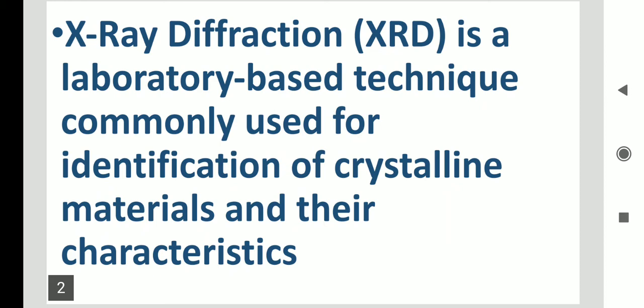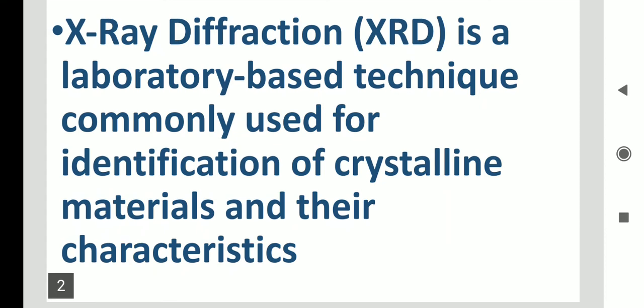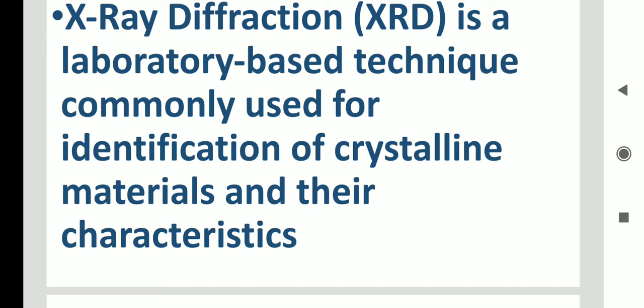It is a laboratory-based technique for the identification of crystalline materials and the study of other characteristics like unit cell, their parameters a, b, c, atomic packing factor, and their dimensions. These types of characteristics will be analyzed by this XRD technique.